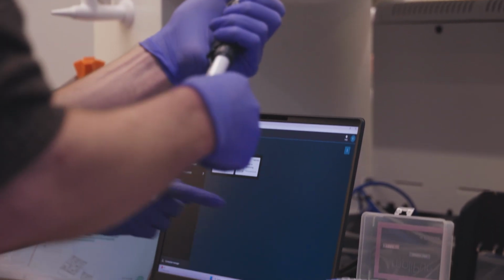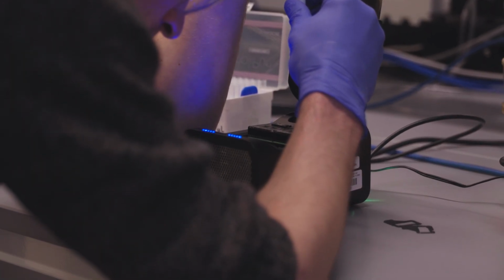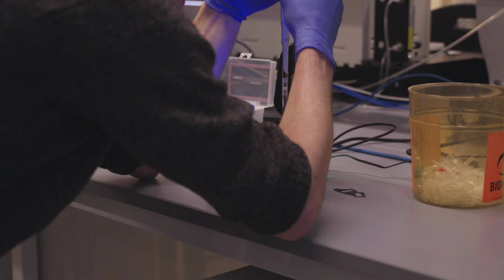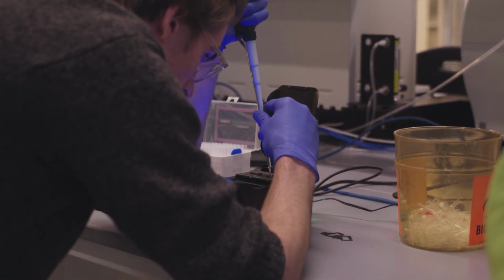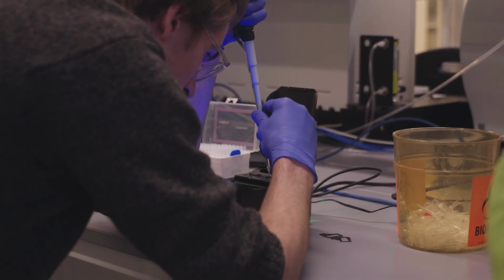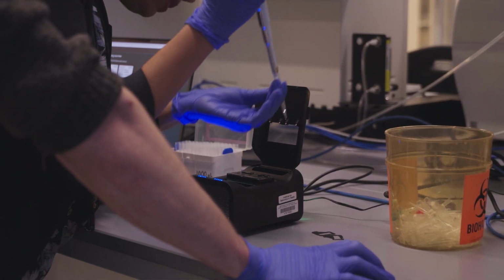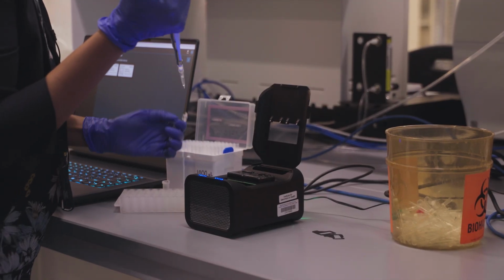So just add a drop, and it is the same inlet over here. One drop. I always feel that if we can hold it straight, then we have more control. Don't push it, just dial it down. Okay, one drop. So there is no air bubble that went inside, right? Just make sure we don't have anything here.